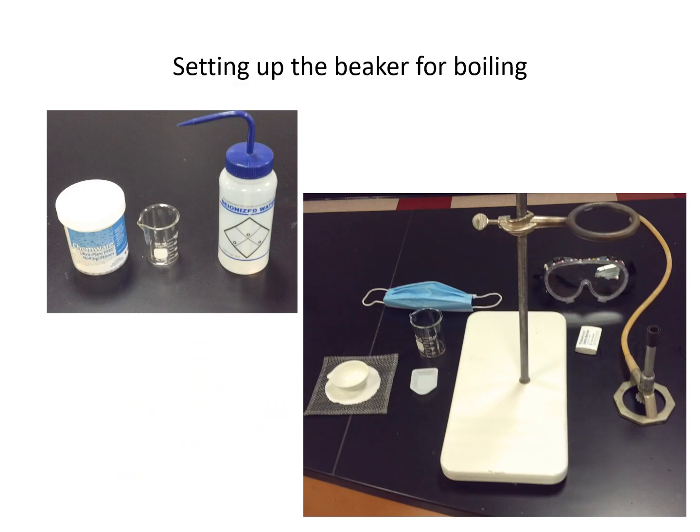So let's go ahead and do the setup for your beaker for boiling. So remember, we have a 2-inch ring here, and what we do is we have it high enough. Get your Bunsen burner set up, but we won't do anything there. And remember, this grill is going to go on here. Then your 100 milliliter beaker, you'll need 1 to 2 boiling chips, no more than 2.